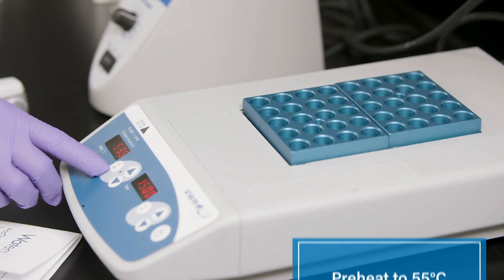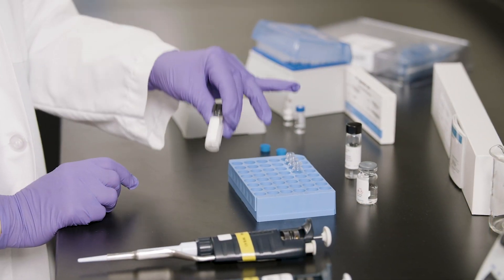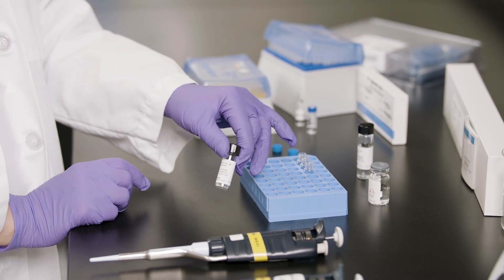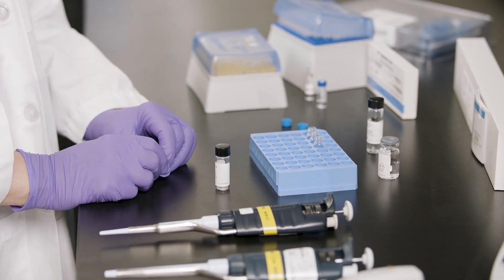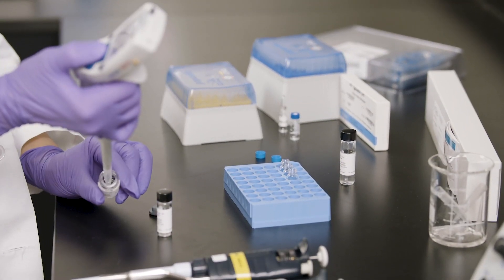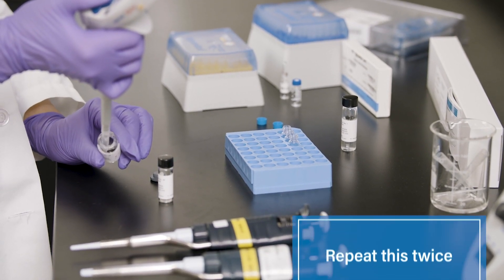To begin, preheat a heating block to 55 degrees Celsius. Next, tap the vial lightly before opening to ensure AccuTag Ultra Reagent Powder is at the bottom of the vial. Then rinse a clean micropipetter by drawing and discarding 1 milliliter of the AccuTag Ultra Reagent Diluent. Repeat this twice.